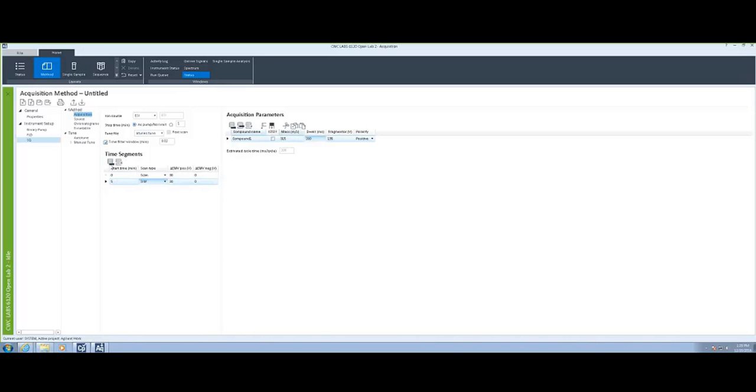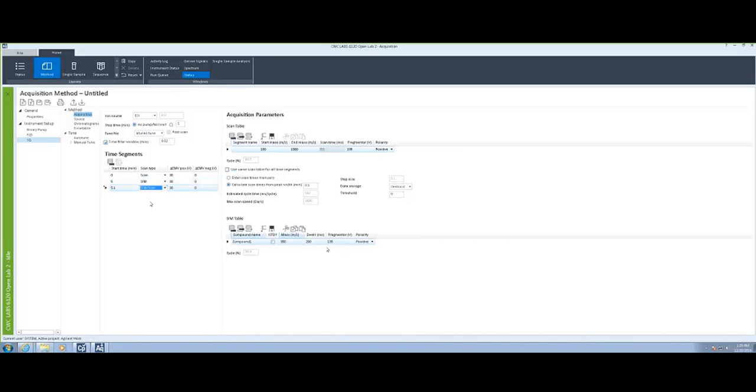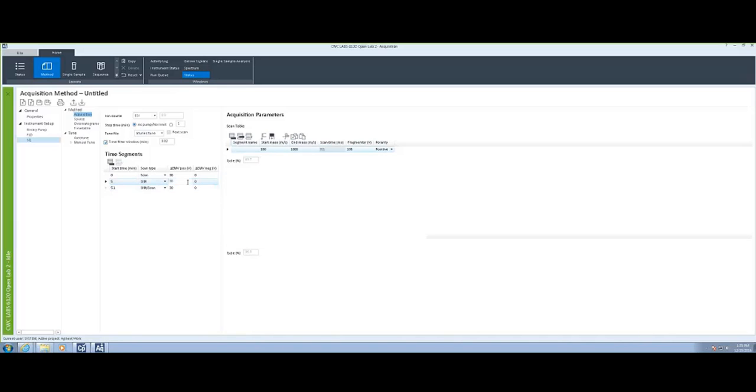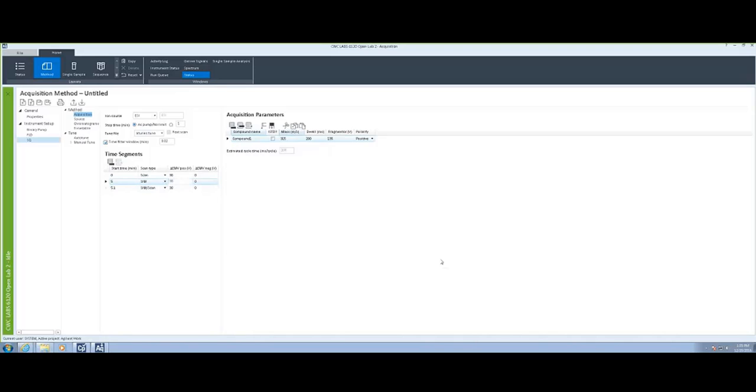And then finally, we have an ability to do both SIM and SCAN at the same time. So if I select this pull-down menu to select SIM scan, I can now define all the parameters that I want to be able to do for both a SIM and a SCAN.